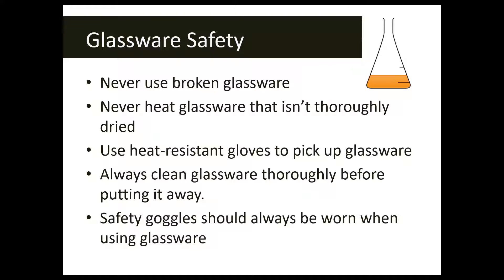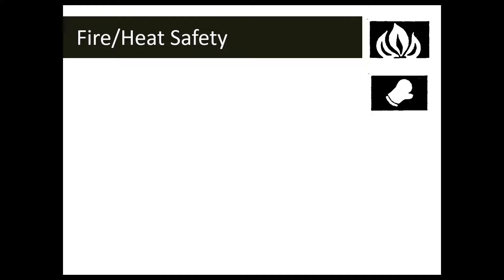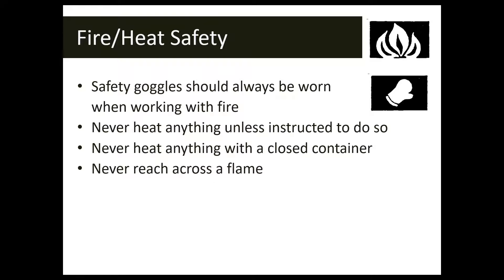Never heat glassware that's not thoroughly dried — a wet piece of glassware on a hot plate could slide off onto the floor. Use heat-resistant gloves, tongs, clamps, or some other utensil if you have to pick up and transfer hot glassware. Always clean your glassware thoroughly before you put it away, and make sure your safety goggles are worn anytime you're using or working with glassware in the classroom.